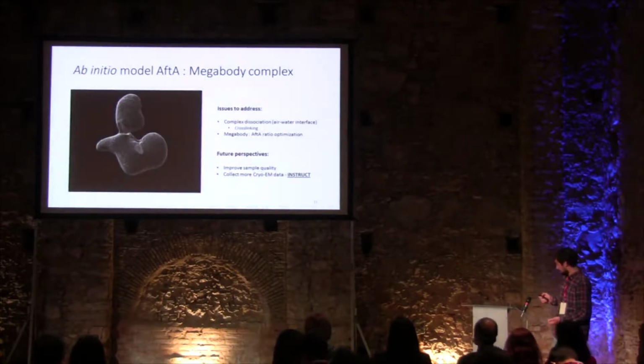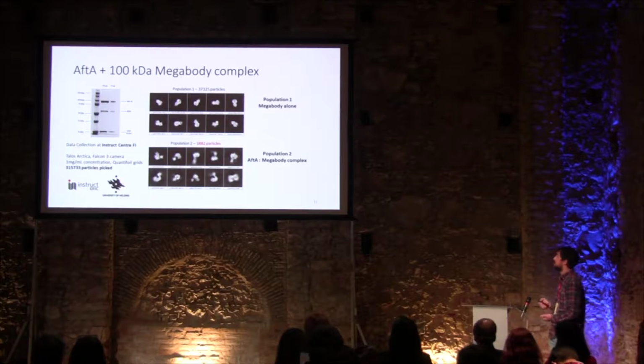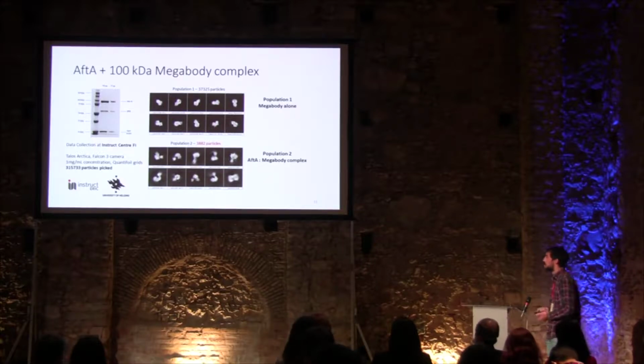So in the end, this is the final sample. So very pure, more or less the intensity of the megabody and the AFTA is more or less even.